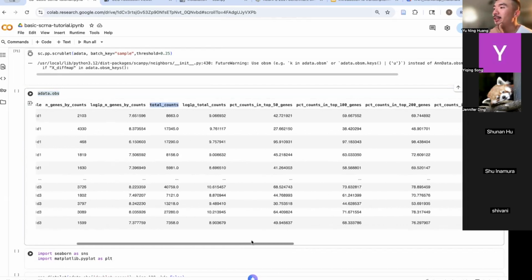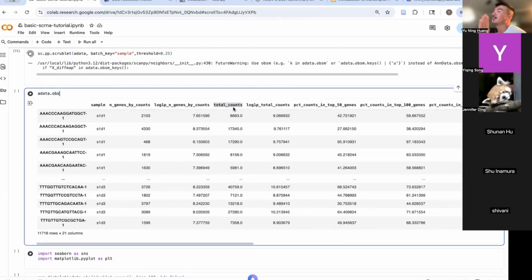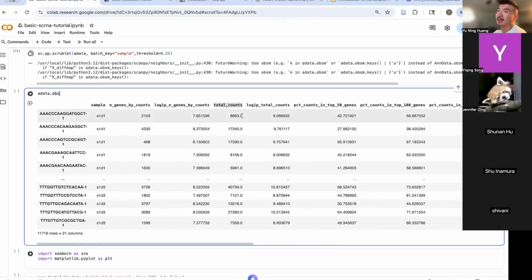And then just keep in mind the adata.obs are the information per cell. So Dr. Louis might be interested in the percentage of changes in certain cells. So later on, we can try to collab. If we came up with the cell name, because right now every row here is per cell. After we do the pre-processing and clustering, we'll be able to add a cell name tag to every row here, and then we can just count different cell types.